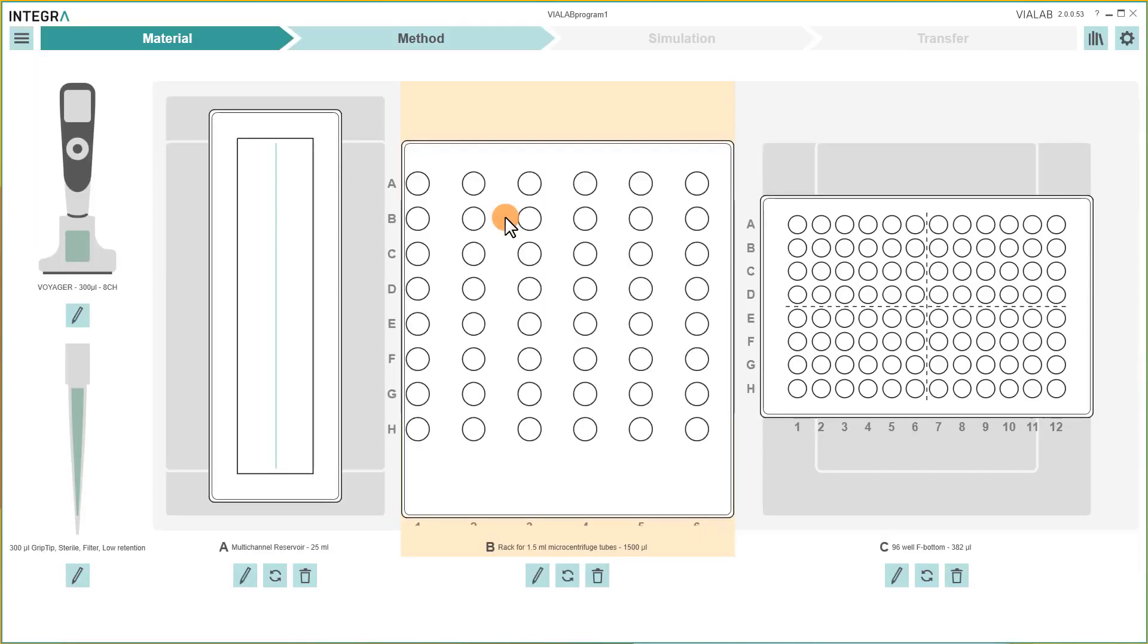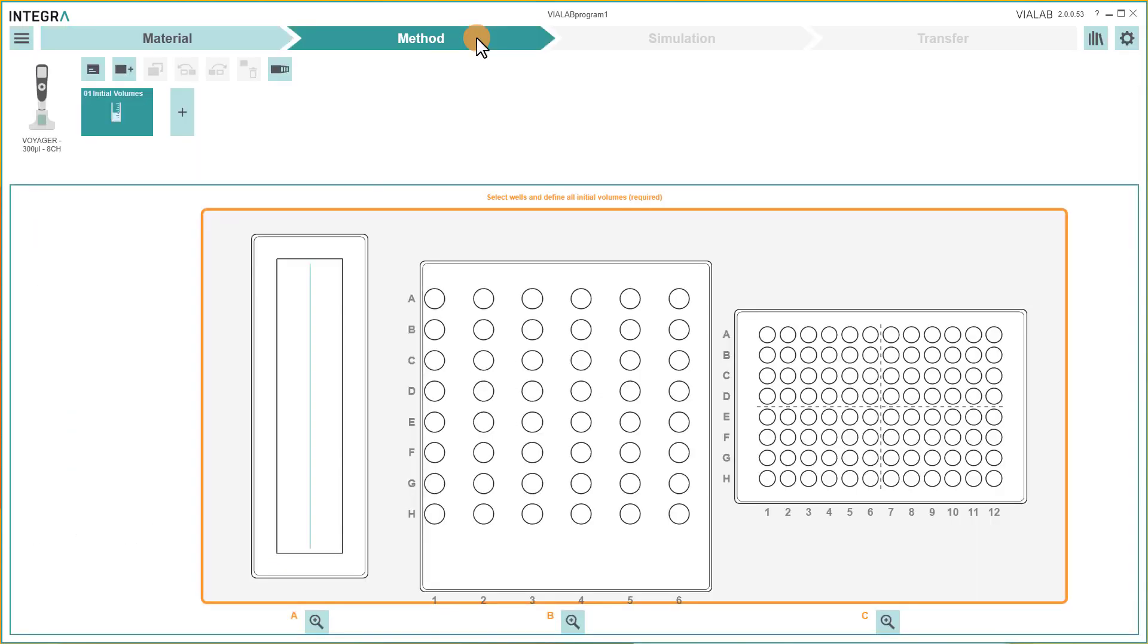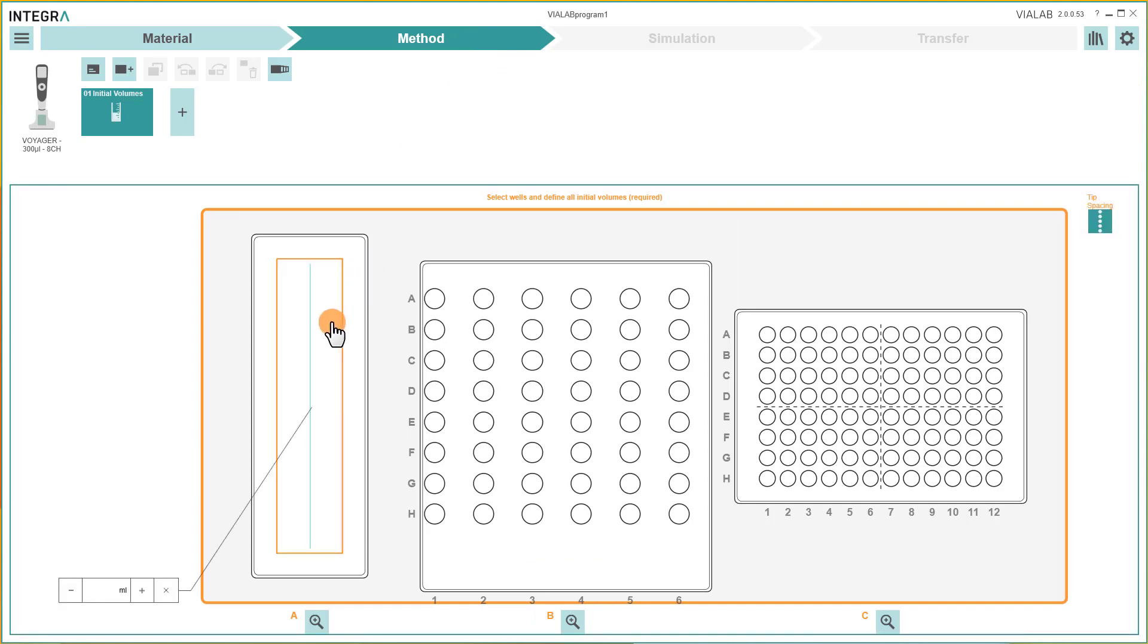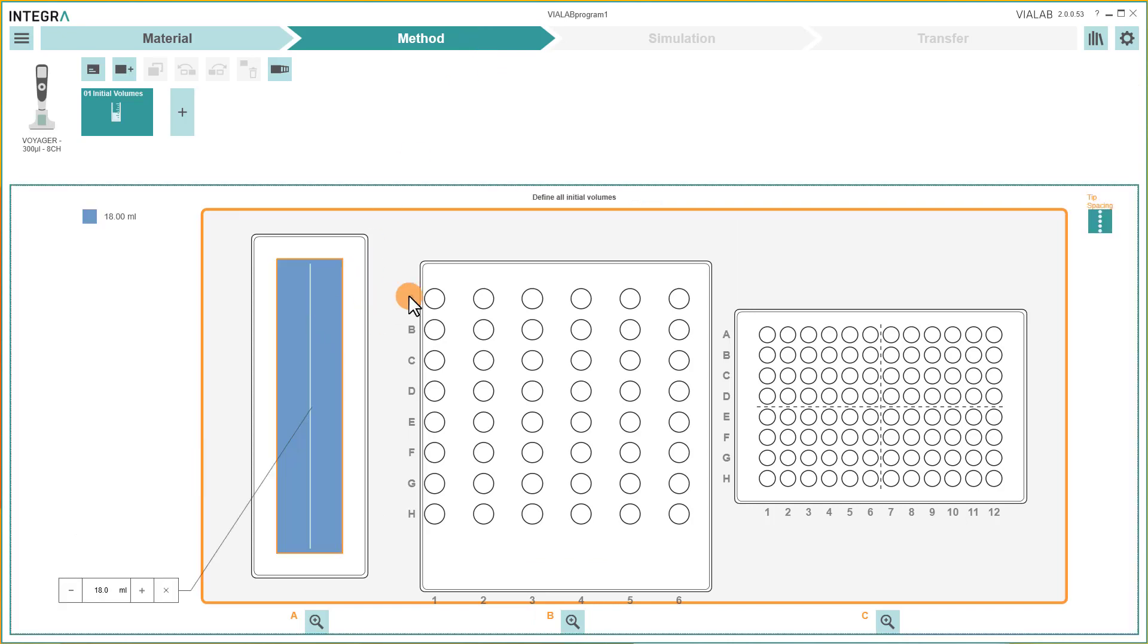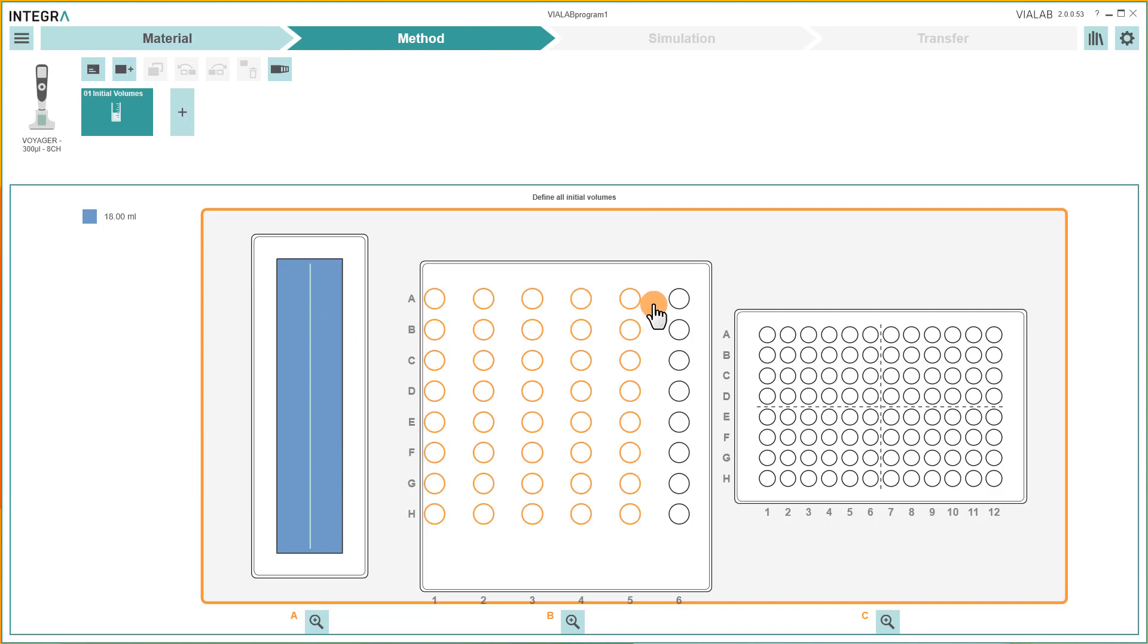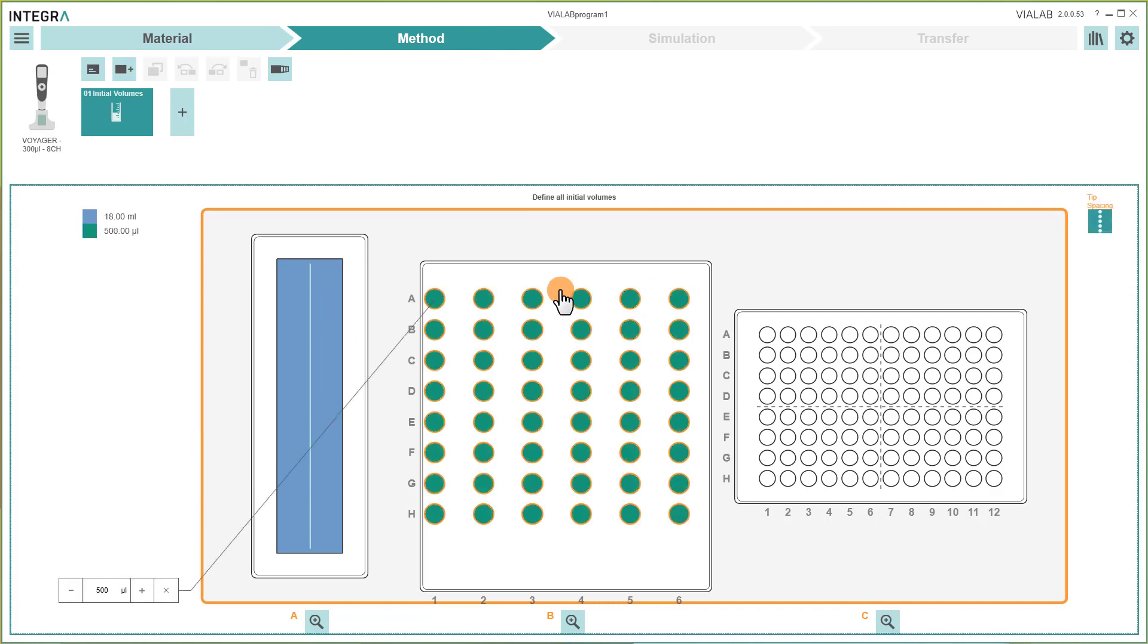To create your pipetting protocol, switch to the section Method. In Step 1, you always have to define the volumes which are already in the vessels. Click on the vessel to enter the initial volume.